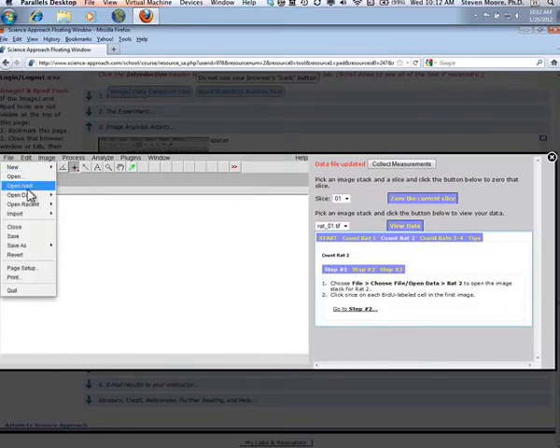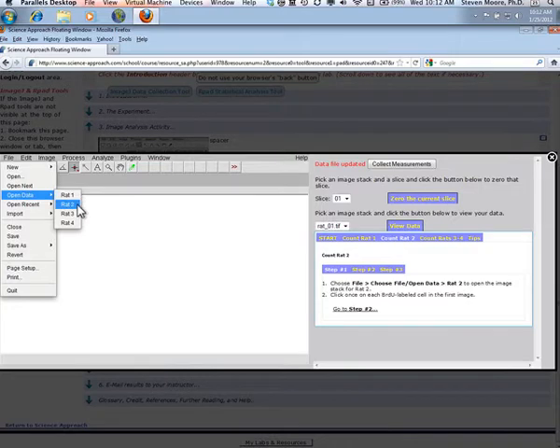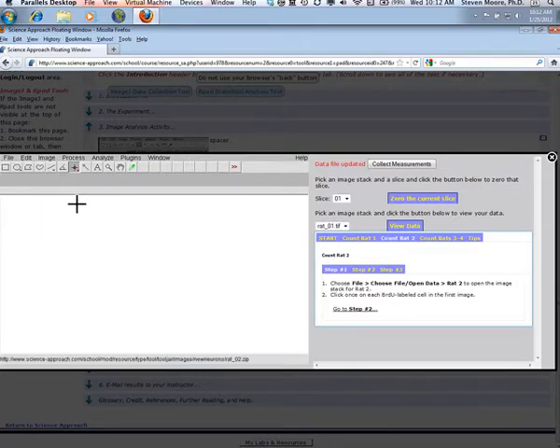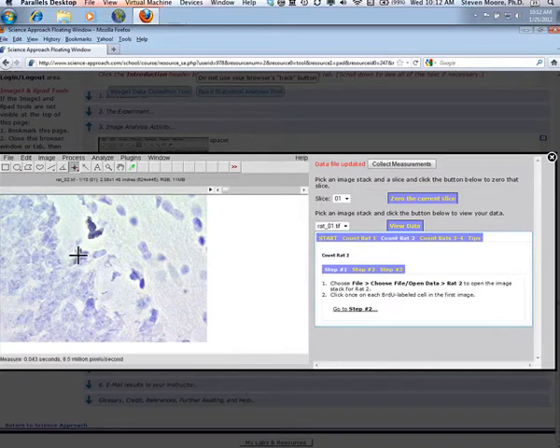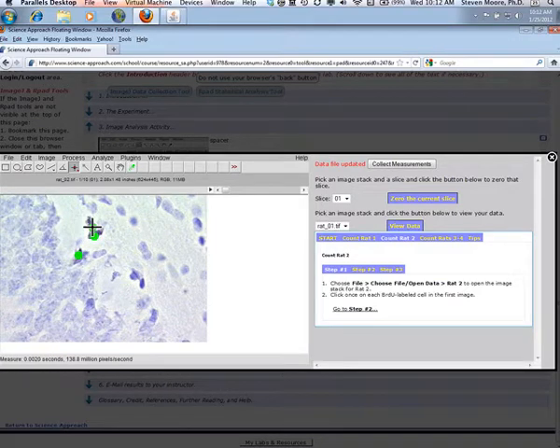Choose File, Open Data, Rat2 to open the image stack for Rat2. Then start clicking on BRDU labeled cells as you did in the first stack.